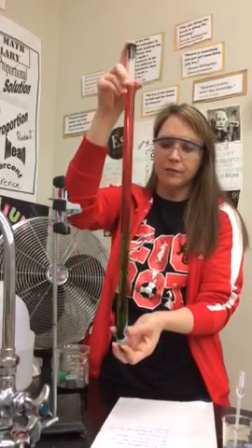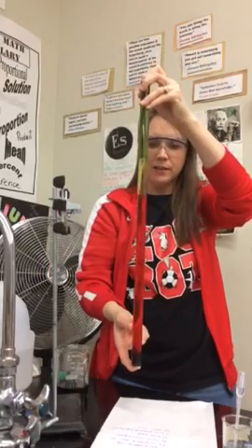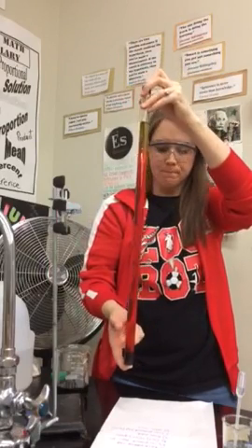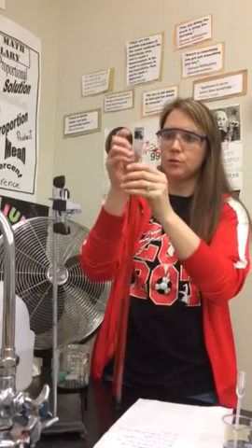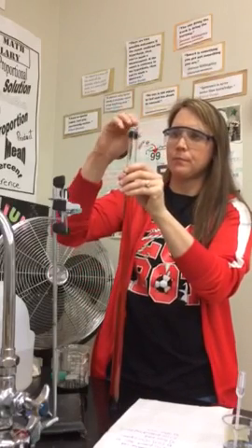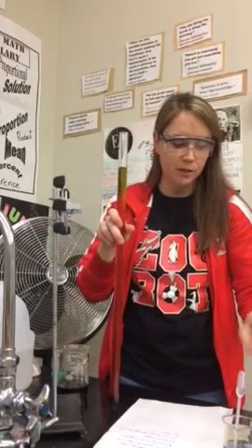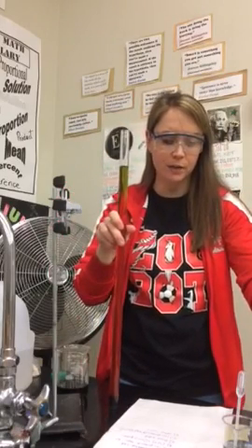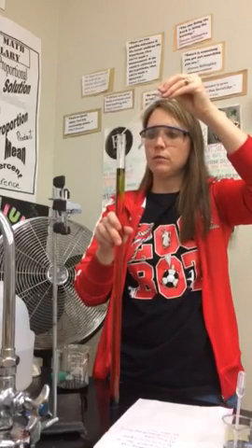Now I'm going to go ahead and flip this over and make an observation as I invert the tube. And I'm going to add another solution to the top here. And I want you to tell me what solution I am adding to the tube. And then once you see it, go ahead and pause the video.